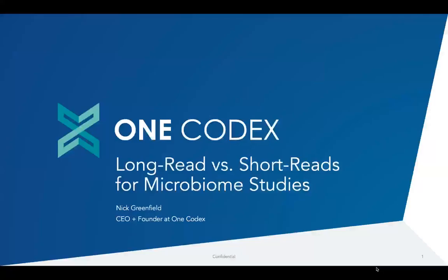So today I'm going to be presenting a bit of data on long-read LoopSeq 16S data compared to short-read V3, V4 Illumina sequencing data, as well as whole genome sequencing or shotgun sequencing short-read data. And I'm going to talk about these three different data types in the context of microbiome studies and some benchmarking that we've done of these different data types across known mixture community standards, and talk about the accuracy of these different techniques and the implications for thinking about and designing your microbiome studies.